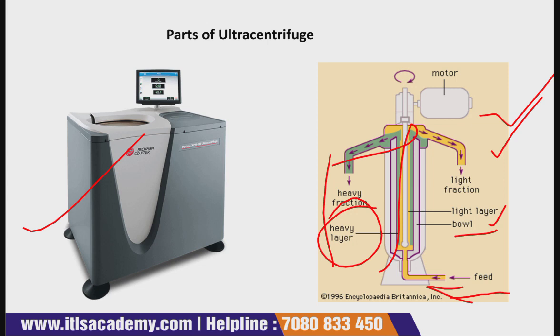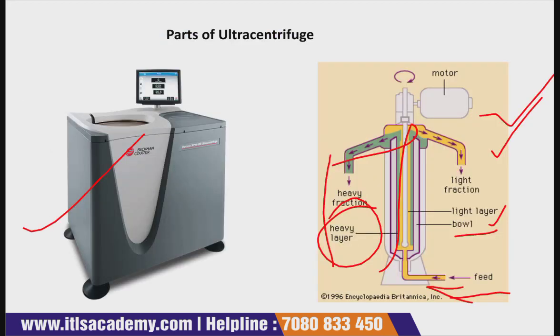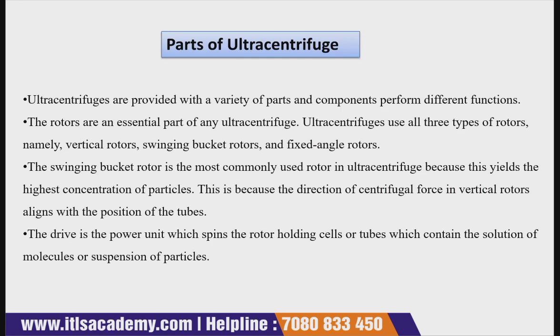And this type of equipment, or device, is always there in the laboratory. So in your laboratory you can check this device. Now again we are going to discuss each part in detail. So the parts of centrifuge. Ultracentrifuges are provided with a variety of parts and components that perform different functions.